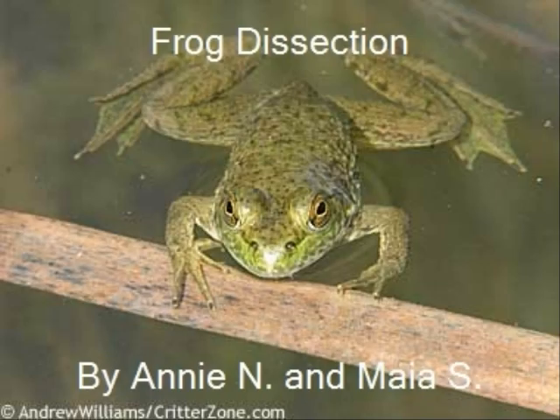The Comparative Anatomy of a Frog by Annie Nielsen and Maya Salinger.